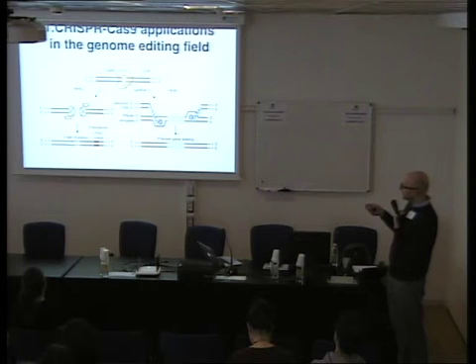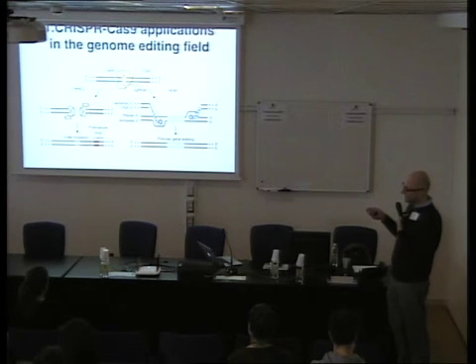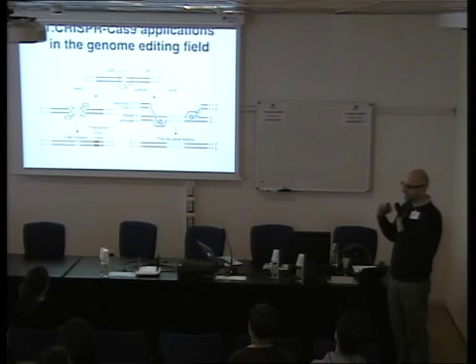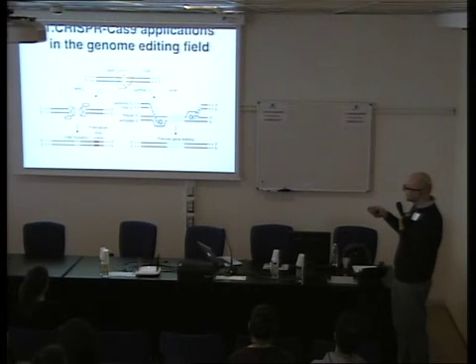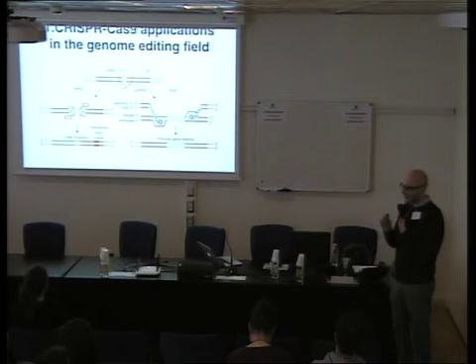On the other hand, homologous recombination is less frequent. But what you can do with homologous recombination is, if you have a template that contains specifically a mutation that you want to recapitulate in your cell line, you add the template, and by doing the double-strand break and using the template, you may eventually generate the exact mutation that you want.